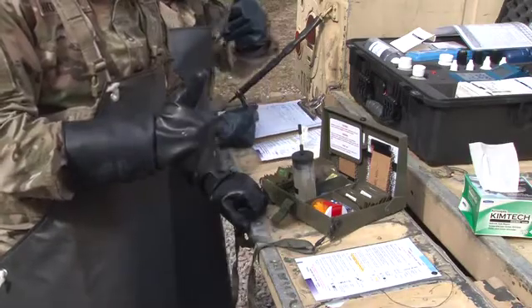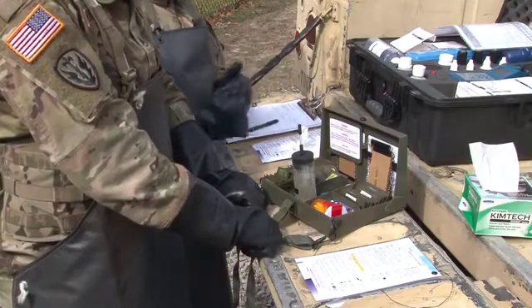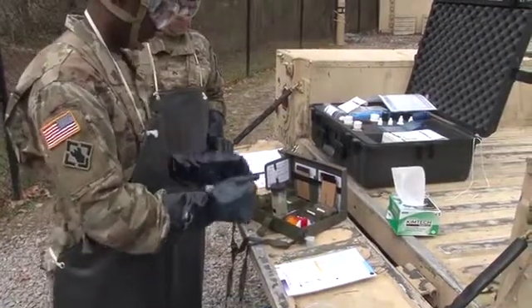Great job, water dogs. You have completed testing your water sample for the presence of cyanide. You are on your way to protecting your fellow troops from dangers of unsafe water. Your next goal is to complete a mustard test.